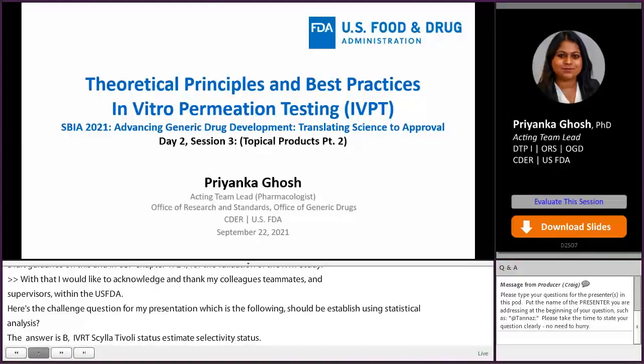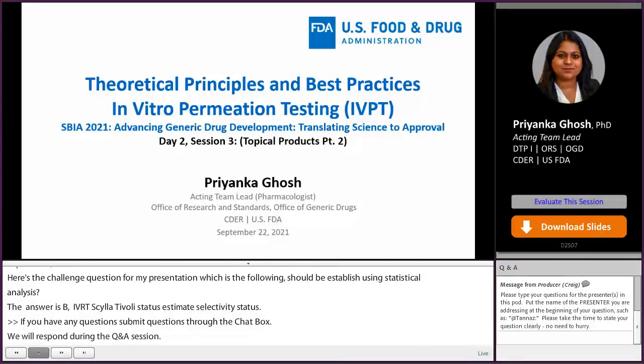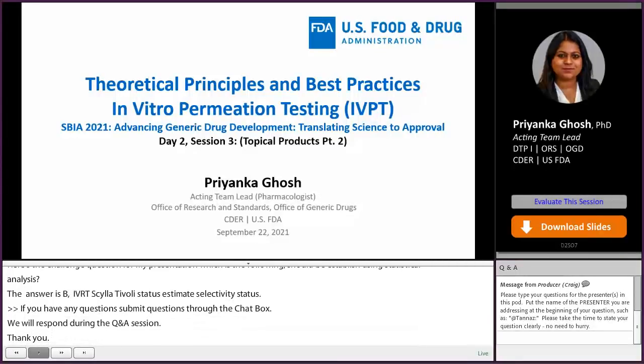I am Priyanka Ghosh. I am an acting team lead within the Office of Research and Standards, Office of Generic Drugs. And today I'm going to talk to you about in vitro permeation testing, or an IVPT study.